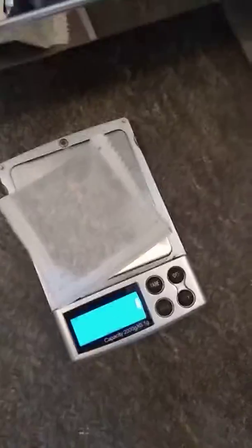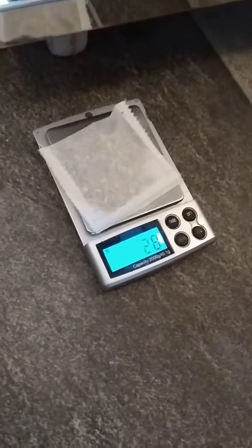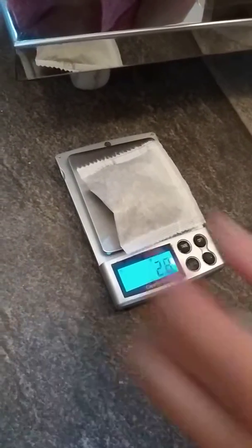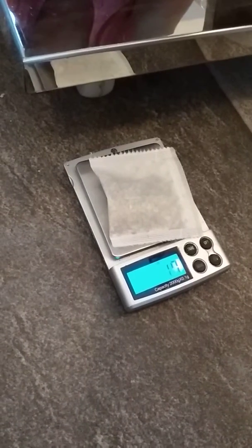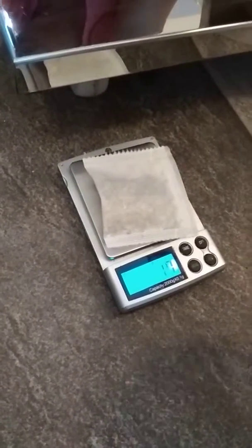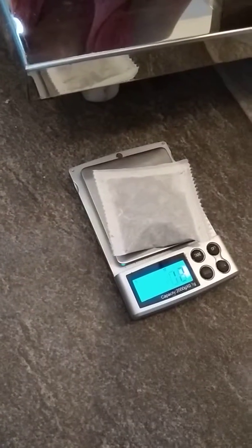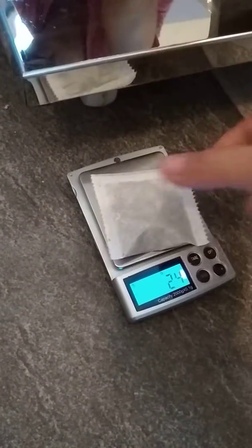When we try to measure each piece, it should be 2.0, but the readings are 2.8 — too much — 2.7, then 1.7 which is too low, and 2.4 which is too much.